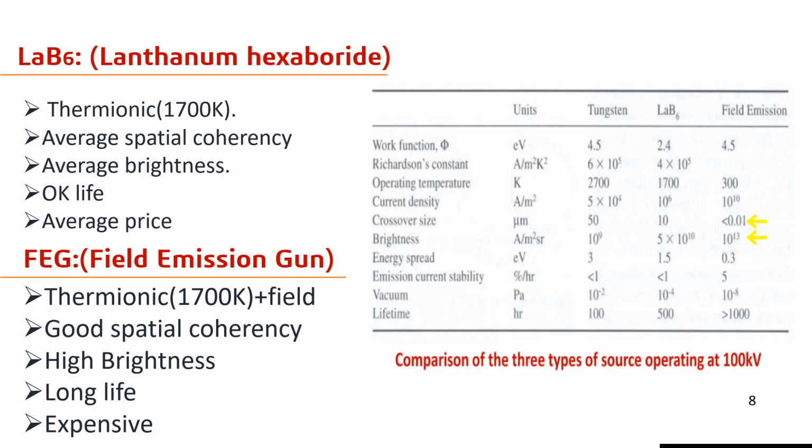And the crossover size also varies. So here we find that the field emission gun is the best, but it is a little bit expensive in comparison to LaB6 and tungsten filament.